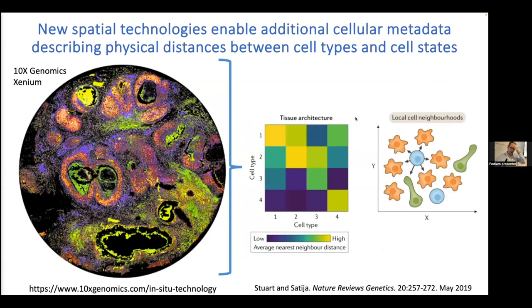All right. And then, this is one of my newer slides. Everything we just talked about can now be done in relation to a cell's position relative to all other cells in a sample. I talked a lot early on about cell isolation or purifying cells. If you aren't interested in a single cell population, you just want to know what you have in your actual tissue, you can cut a section, 10 micron or 4 micron, and put it onto a glass slide. Now there are methods to actually image the RNA in place on a slide. That's what the starry night figure is showing.